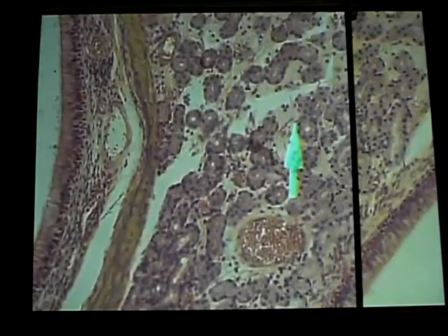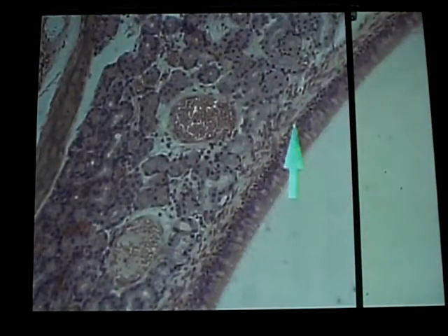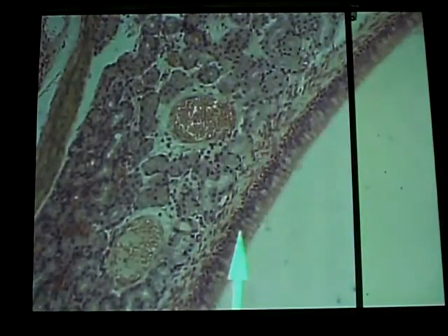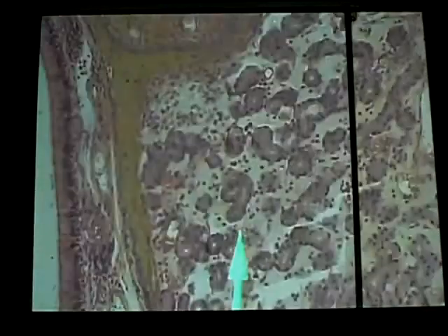So it's going to be identify the mucosa, and as you are asking for the final exam, it's going to be cumulative in terms of the stuff that you're using to identify whatever slide you're looking at. So we know this is our respiratory mucosa, so if I ask you what type of epithelium this is, or classify the tissue, then you should know that that's pseudostratified epithelium. I could ask you to identify the apical specialization, which is your cilia. I could ask you to identify the cell, which is your goblet cell. And pretty much whatever's on the slide can be asked.